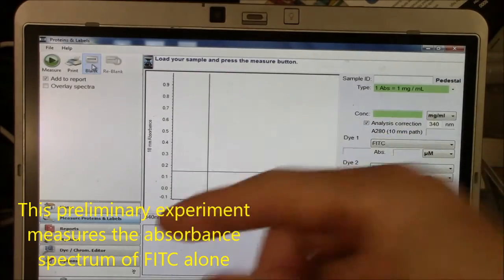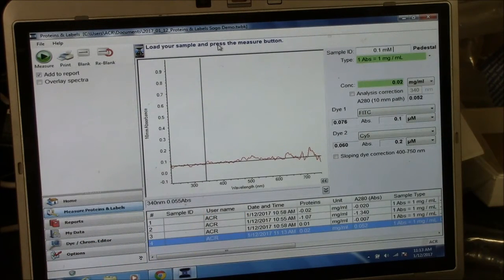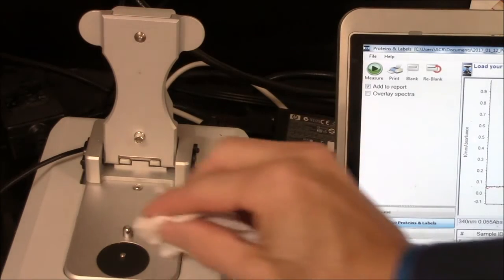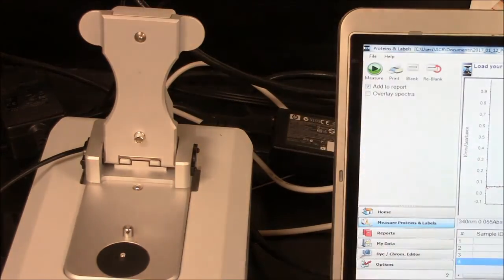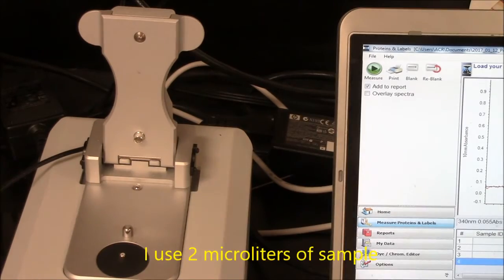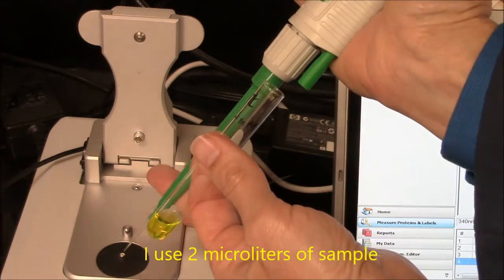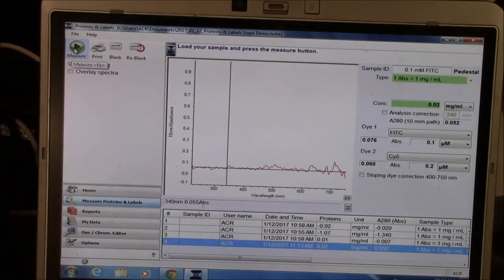Now I'll load my sample and measure it. I'm typing in a name for my sample. This has no protein in it. Wipe the top and the bottom, put my sample, measure.